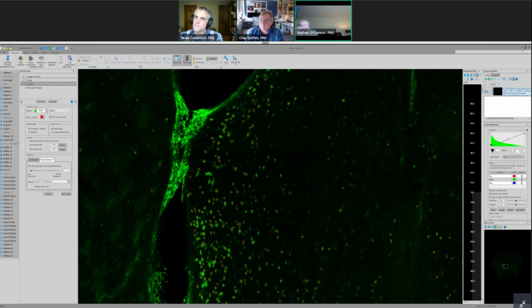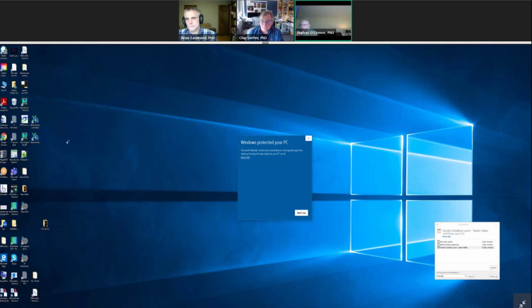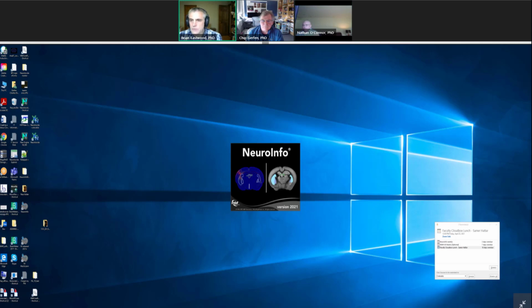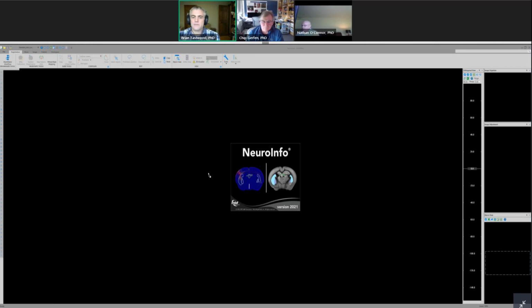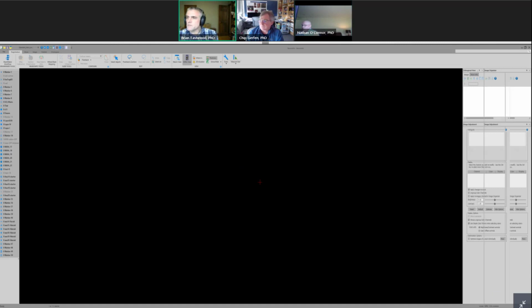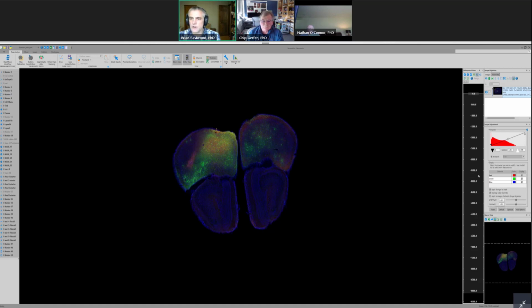One really relevant question that just comes in is, does MBF do the training and supply the classifiers, or does the user have to do the training? I think that's a really great question. Right now, for the neural networks that we're building into NeuroInfo, we are doing training for a couple of different types of cell labels, and we are also looking at what it would take to enable in-the-field training of cells as well. It's a challenge. There's a lot involved in building and validating a neural network, so figuring out exactly what aspects of that can be done in the field is an ongoing area that we're working on.